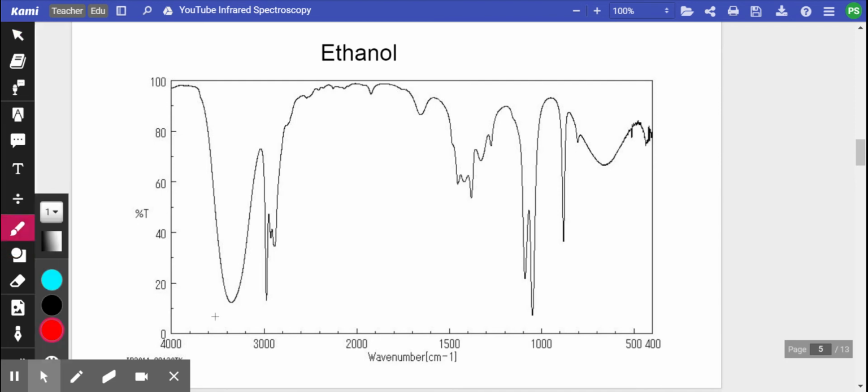However, if the sample absorbs around, let's say, 3200, as we can see here, we will see a dip or a peak. That's because that energy is not going through and it's not getting detected at the end, because instead it's being absorbed by the compound. We see another peak here, around 3000, and some peaks below 1500. Now, this is the basics of how infrared spectroscopy works.